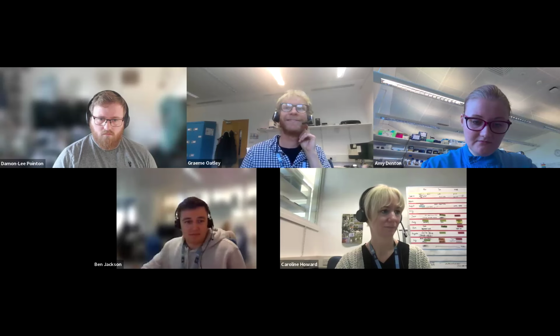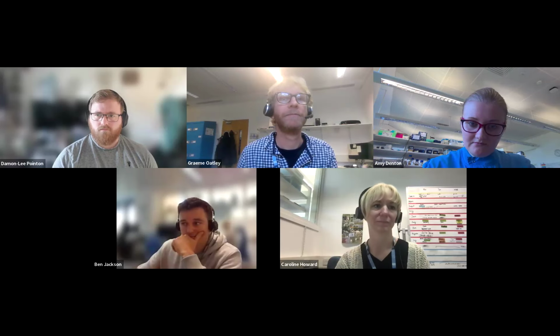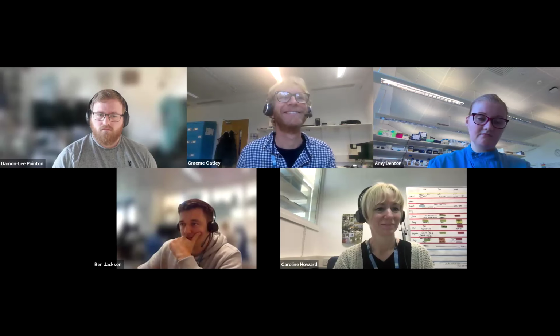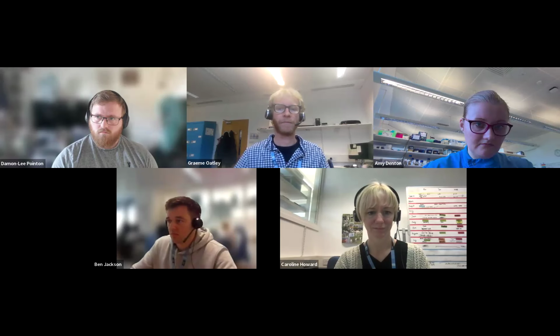Yes, hi. The particular sample that we're struggling with is one from the Protea family. But we also have a few others that are succulents or plants that you get in the wild, so they're not cultivated plants, and some of them grow in arid areas. So it's also not always predictable. Some samples had a very low ratio and still produced good libraries that we could sequence. But with others, when you Qubit the library at the end, it's either too low to read or around 2 nanograms per microliter, which is way too little for sequencing for ONT.